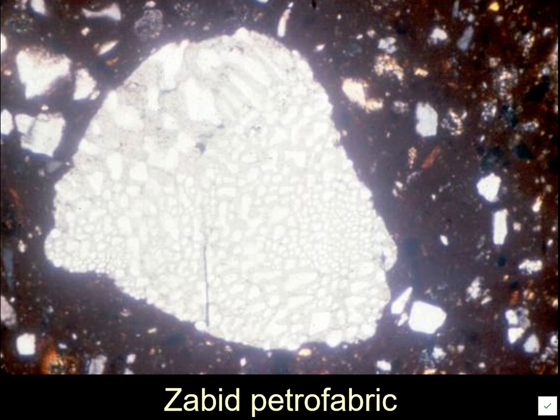But also there were intrusive rocks, and among these are these very unusual feldspars with quartz inclusions inside them. This is known as granophyre.